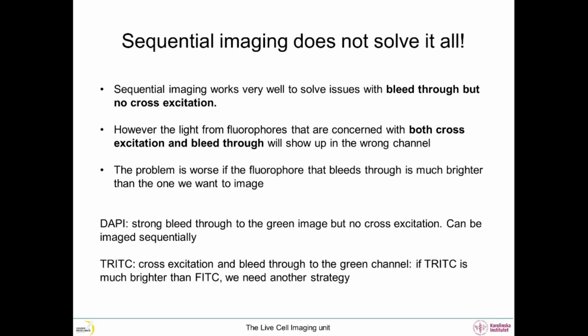So if we go back to our triple labeled sample, DAPI strongly bleeds through to the green image and a little to the red image. However, DAPI is not cross-excited by the lasers used in the other 2 channels, so we can image safely. And we know that DAPI will not participate in the green and the red images.